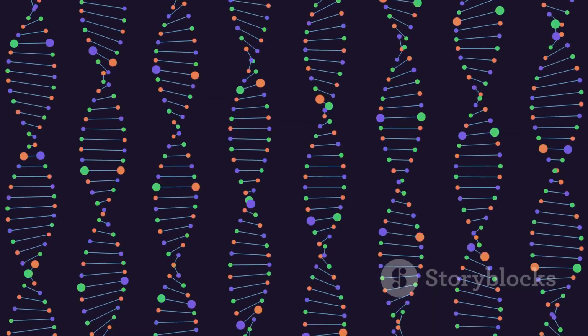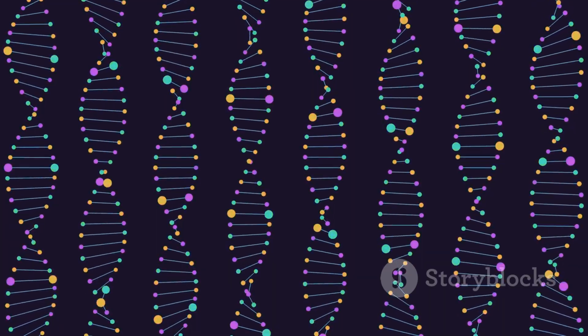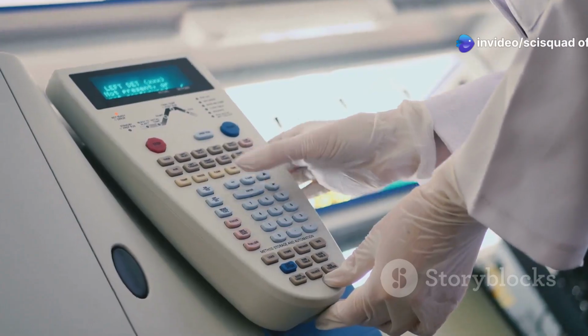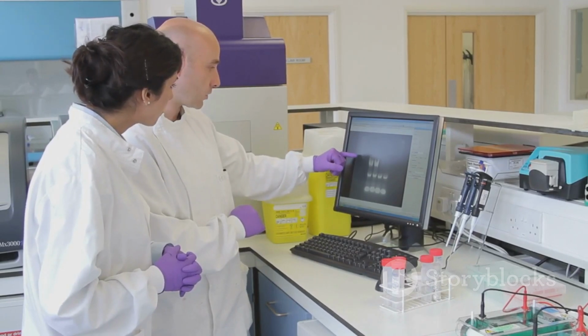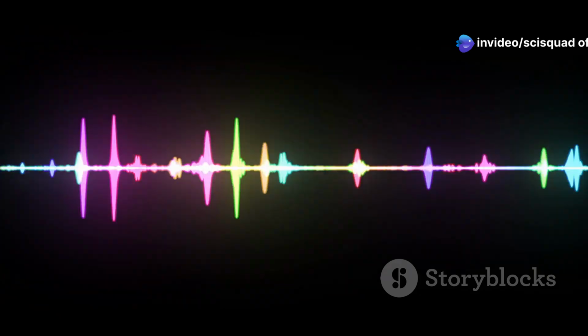Imagine a parade of colorful lights, each color representing a specific nucleotide. This dazzling light show is captured by a detector which records the color and order of the passing fragments. The detector then generates a chromatogram, a graph showing the color peaks corresponding to each nucleotide in the sequence. Picture a barcode, but instead of black and white stripes, we have a vibrant display of fluorescent peaks.